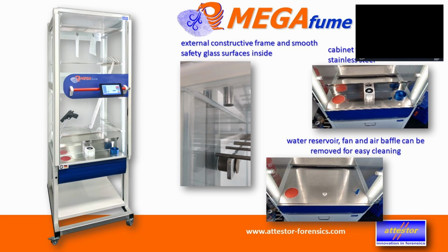So in most of the accredited labs we know, they say you have to swap out the water after every run. And if you have a fixed tank for that, that's rather difficult. So we made that little, let's call it a cup, like a mug. We made that to easily come off. You see on the lower picture, this is just like a pin coming up. That is the heater. So we have the actual cup sitting on there.